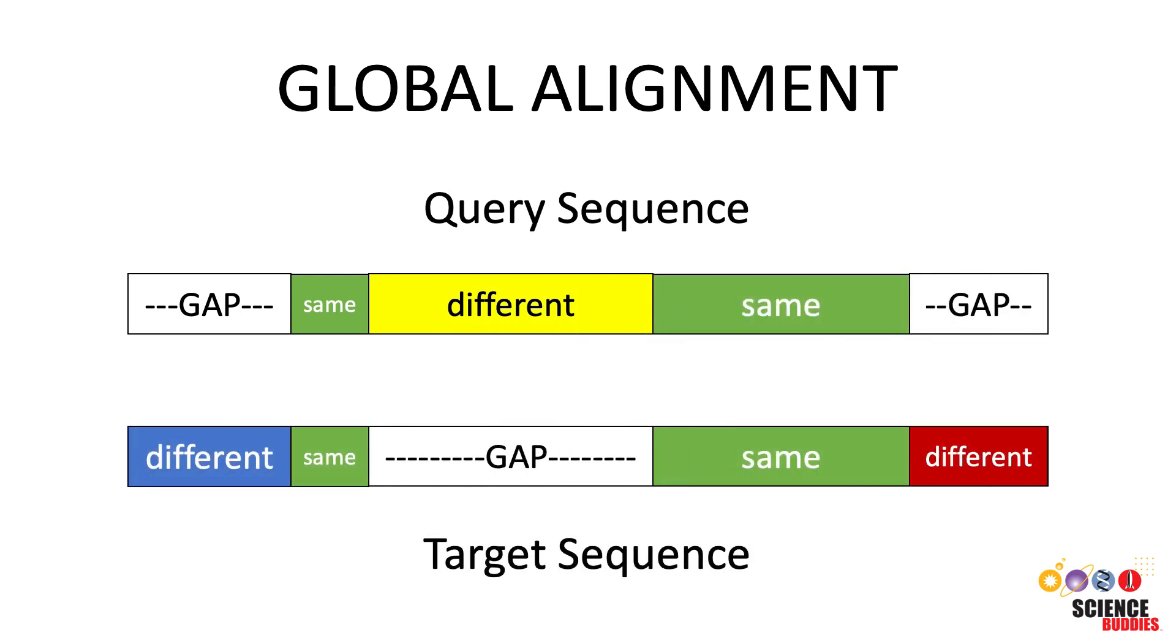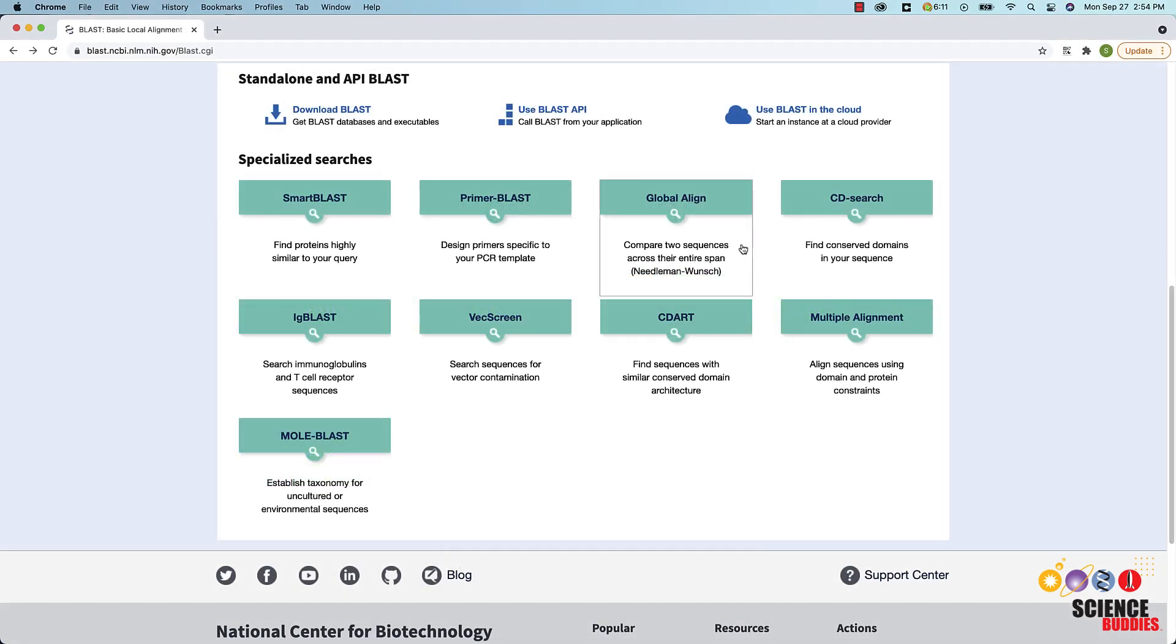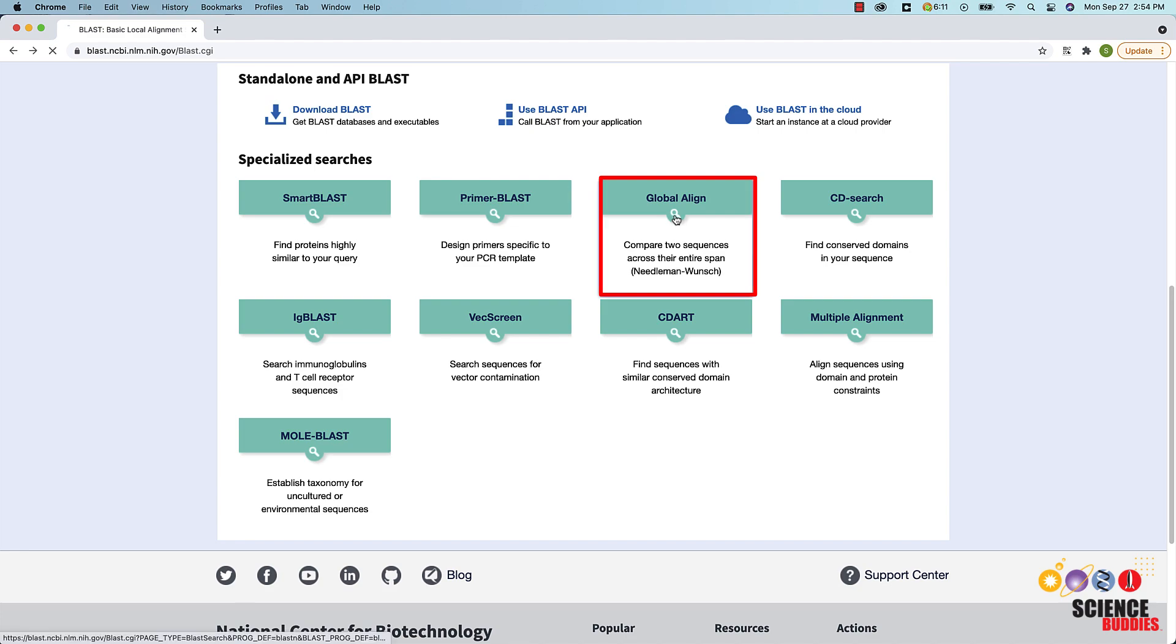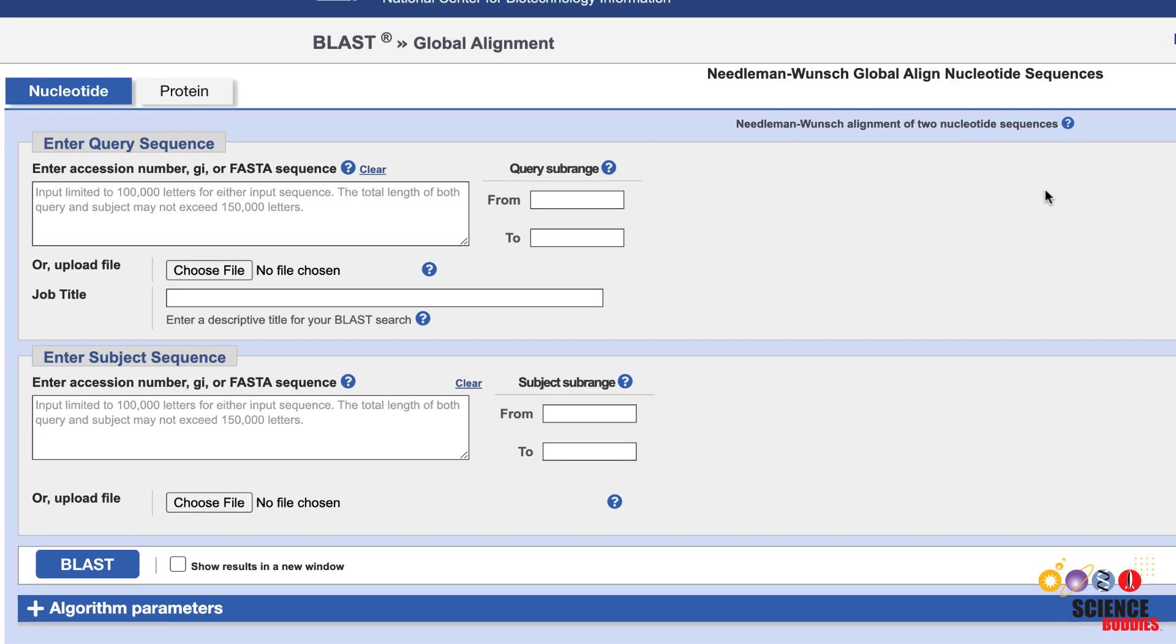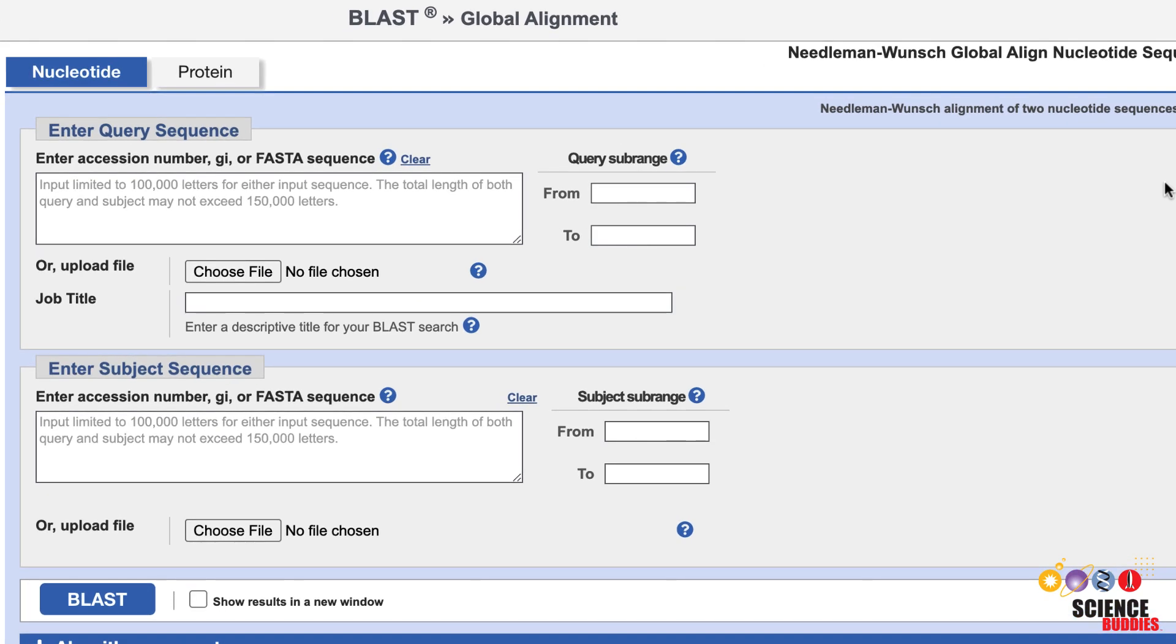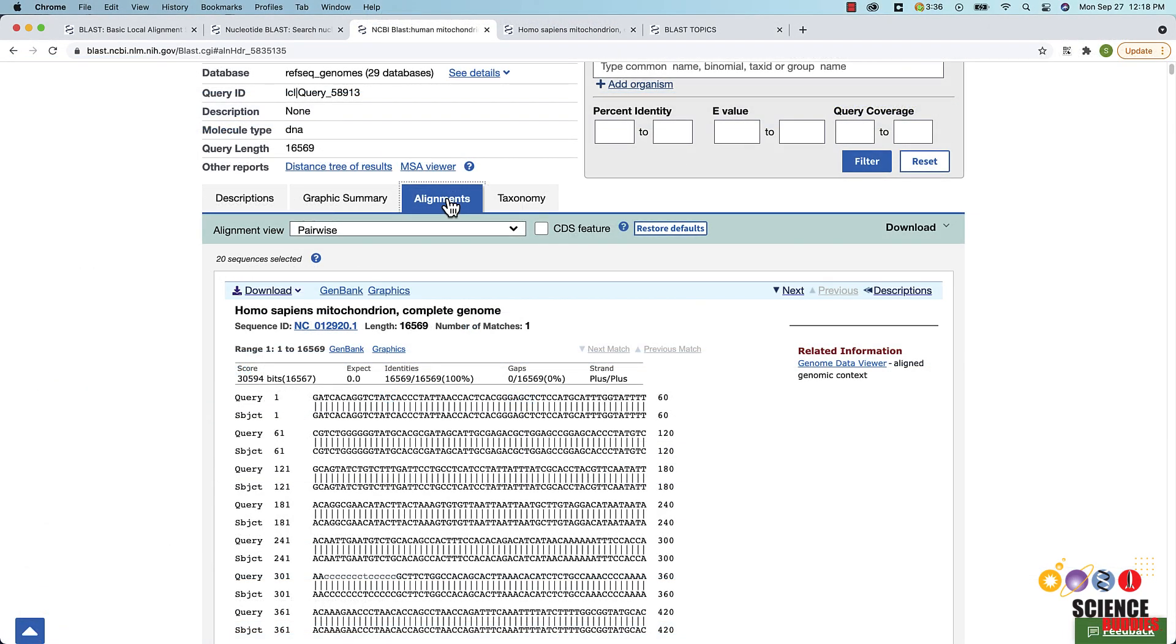You can do a global alignment of two sequences by clicking on Global Align in the Specialized Searches section of the BLAST main page. On the Global Align Query page, enter the two sequences that you want to compare in the Enter Query Sequence and Enter Subject Sequence box and then click the BLAST button. Again, check the Alignments tab in the resulting BLAST report for more details on your sequence alignment.